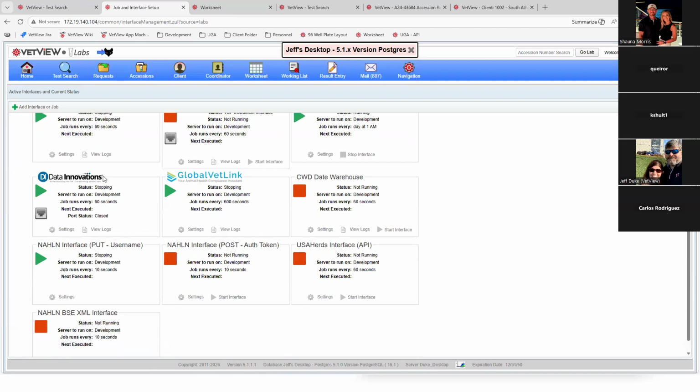Let's talk specifically about Data Innovations. Data Innovations is one of the primary ones that we've supported for a long time. It is a hub and spoke system. What I mean by that is we talk to Data Innovations, and then Data Innovations brokers that out to different equipment for you. That's their whole business model. They have a whole library of different instruments that they can talk to and interact with for us. They standardize all the data and then send it back to VetView for us to read in.